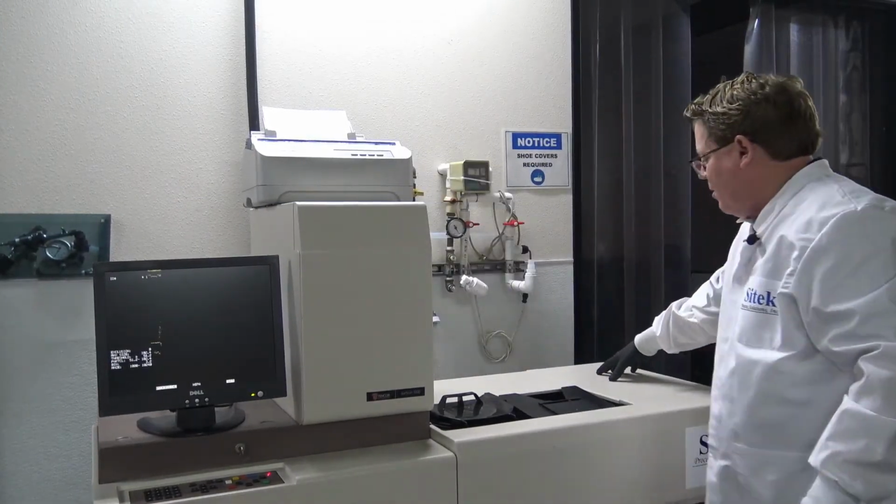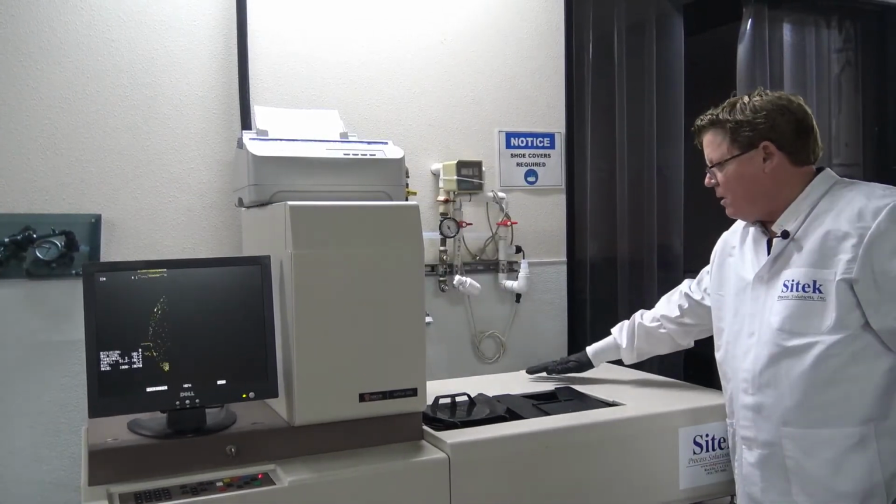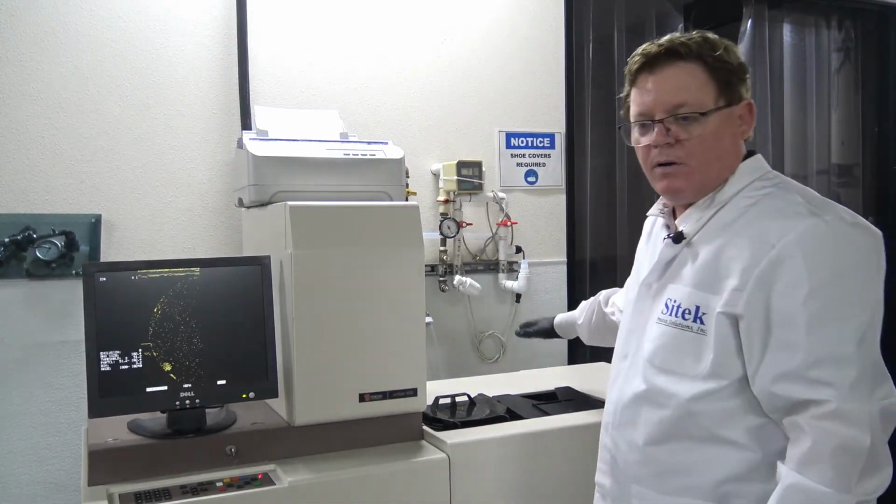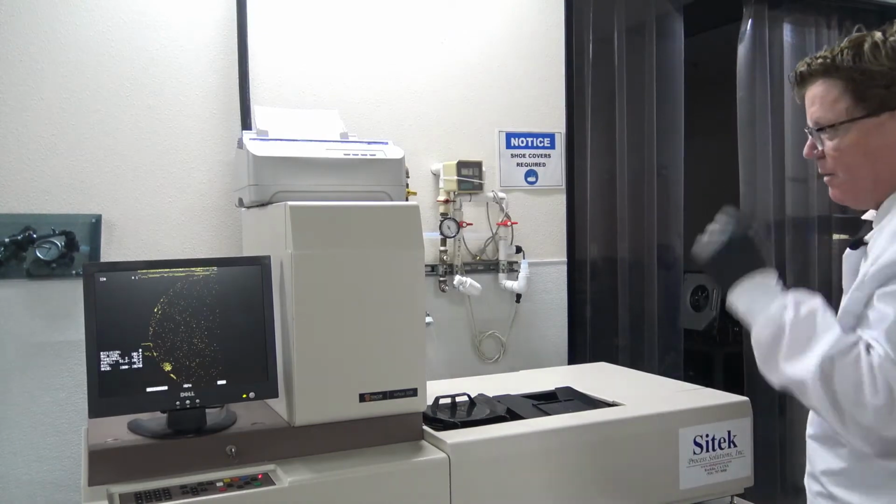Do not put it on here, because what it does, the weight will push down on the metal tops, and that will push down on the arm. So you do not want our printer sitting on top of the process area.